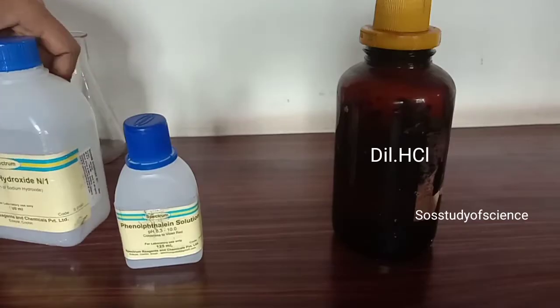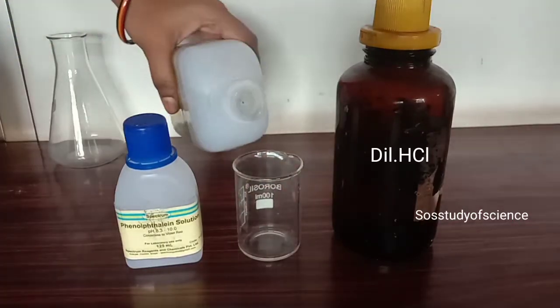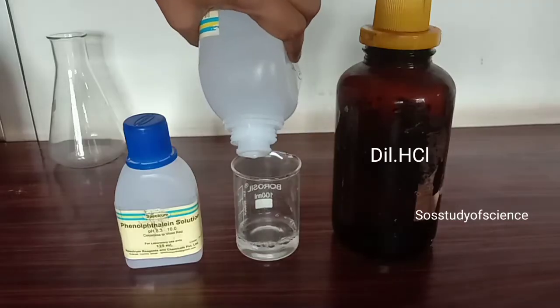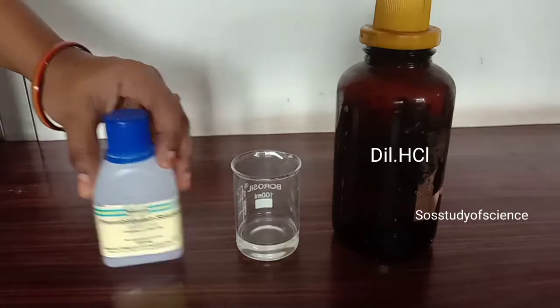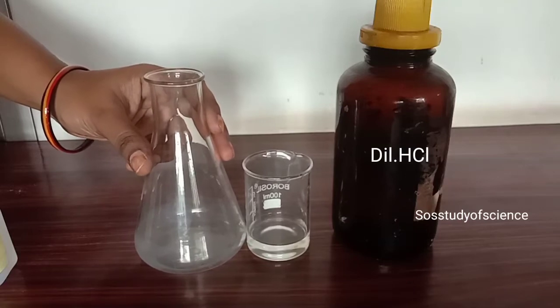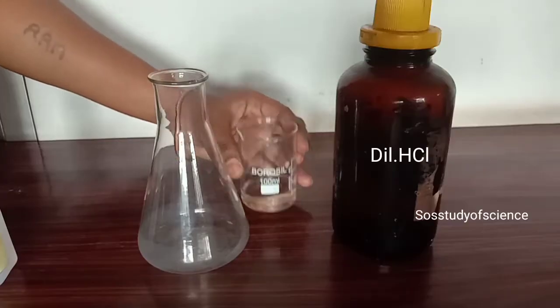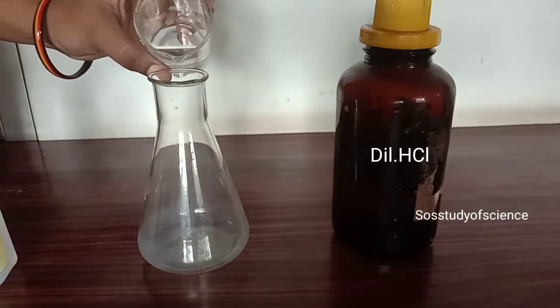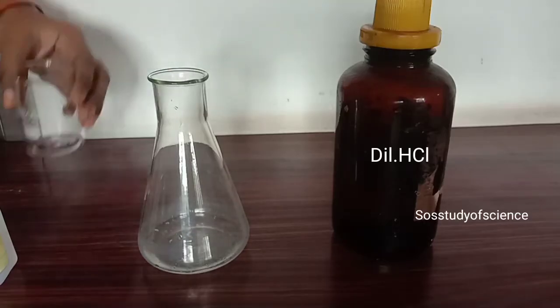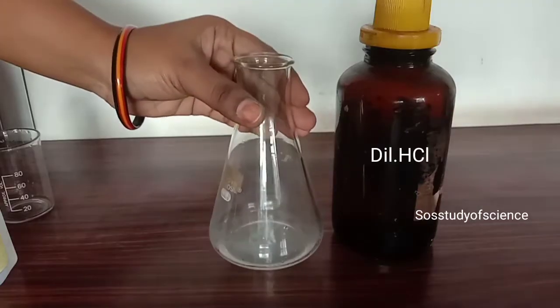Take some amount of sodium hydroxide solution and transfer it to the beaker. Now take a conical flask and transfer the sodium hydroxide solution to the conical flask. We can observe that the sodium hydroxide solution is colorless.